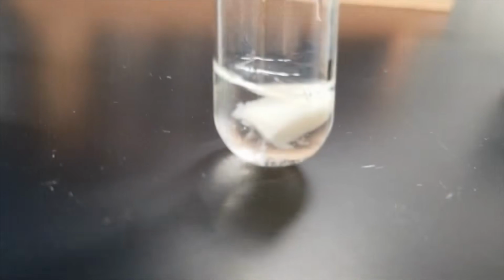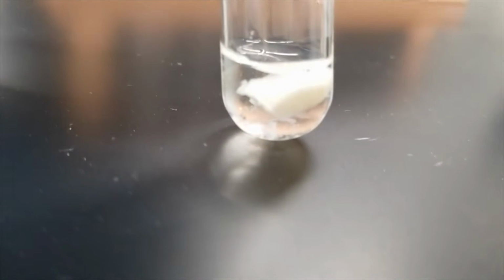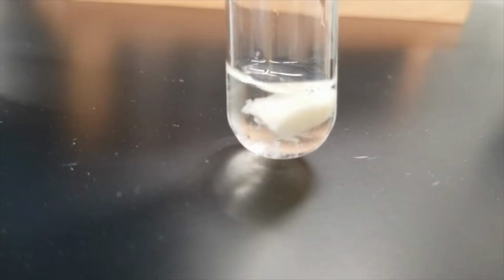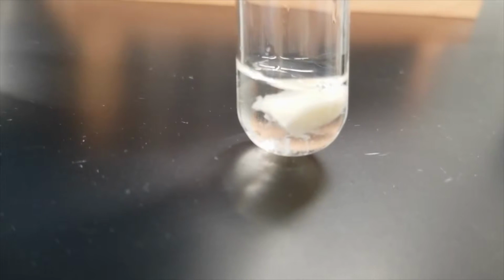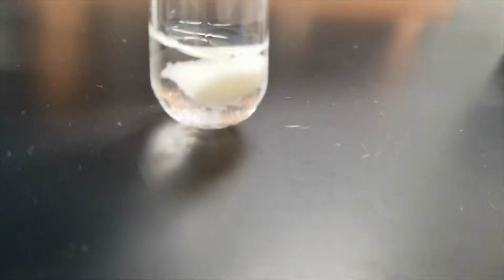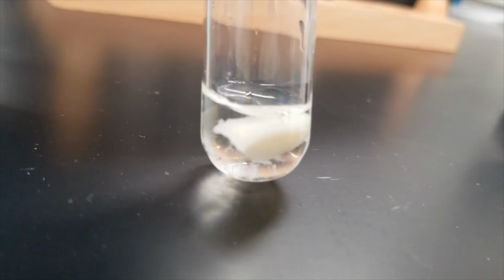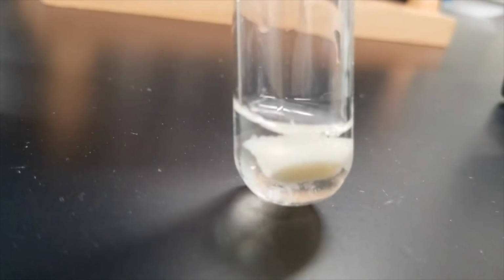All right, so you probably notice some things floating around in there. Those are just flakes of boiled potato. You can tell they're not oxygen because those bubbles of oxygen gas would be rising to the surface of our hydrogen peroxide solution. You can see that that's not the case. I think there's a few bubbles at the top there that are staying stationary. Those are probably just air that got trapped when the potato chunk was dropped in.